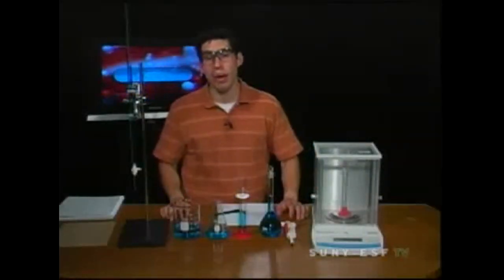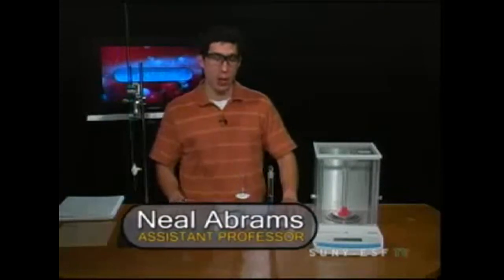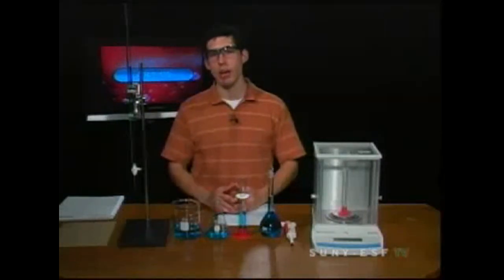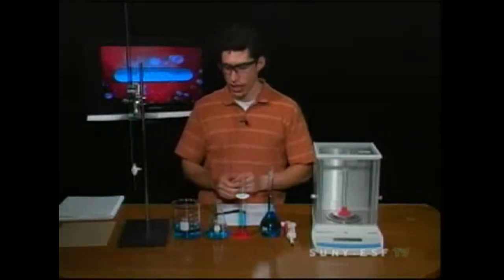Hi and welcome back. Today we're going to talk about measuring volume in the lab. There are a few instruments that we use in the lab to measure volume, and they differ in accuracy. We're going to talk about each of those and how they can be used in the lab.